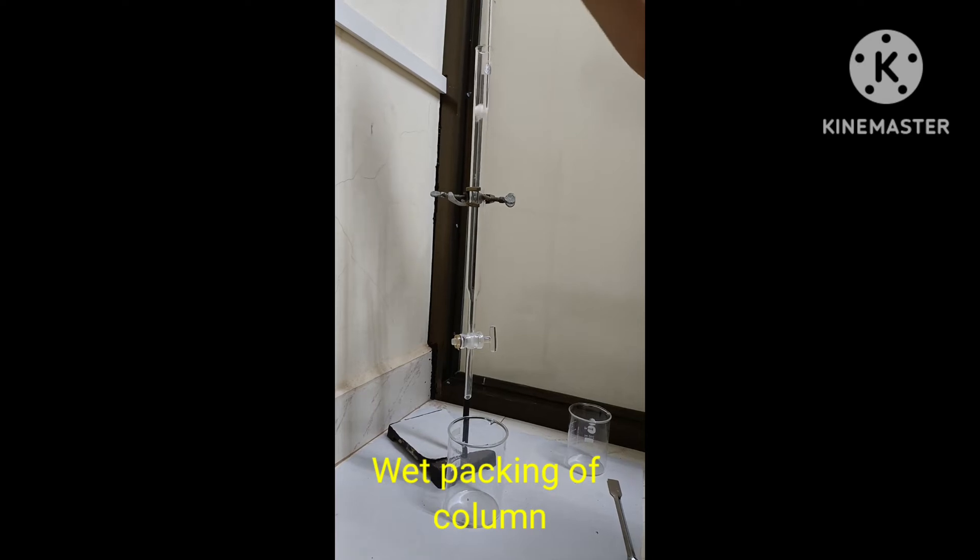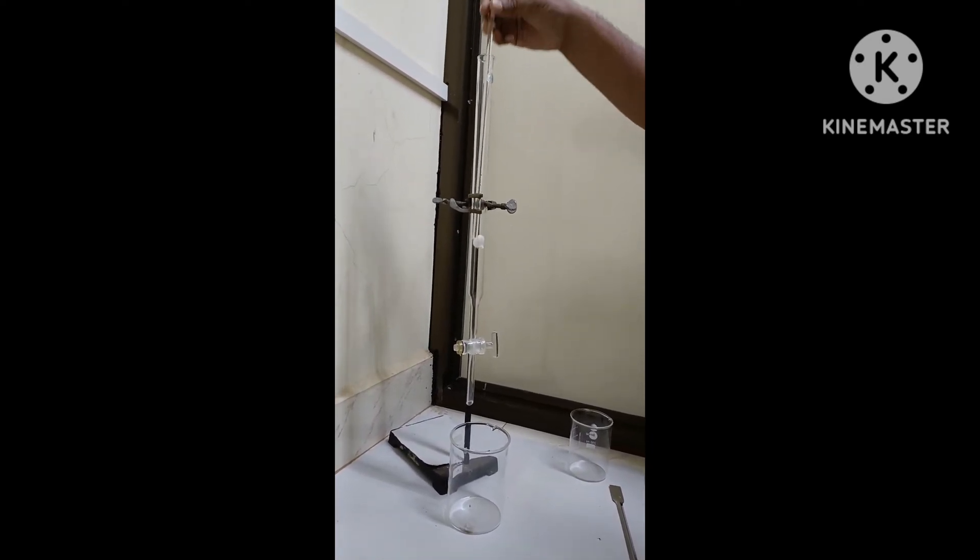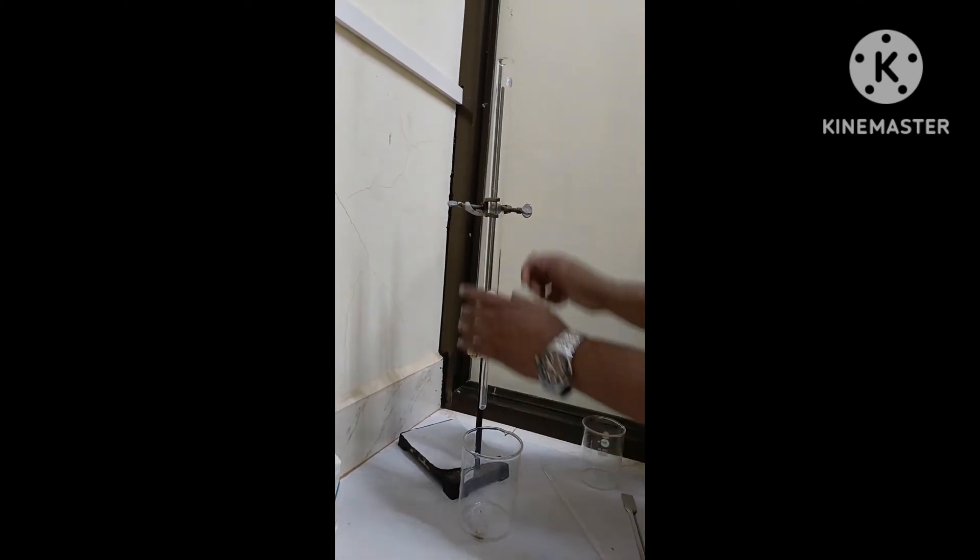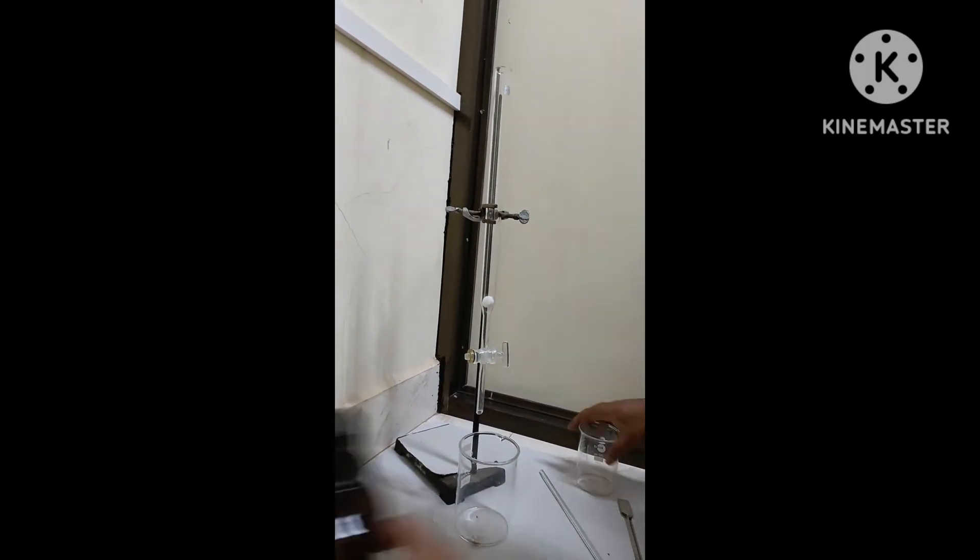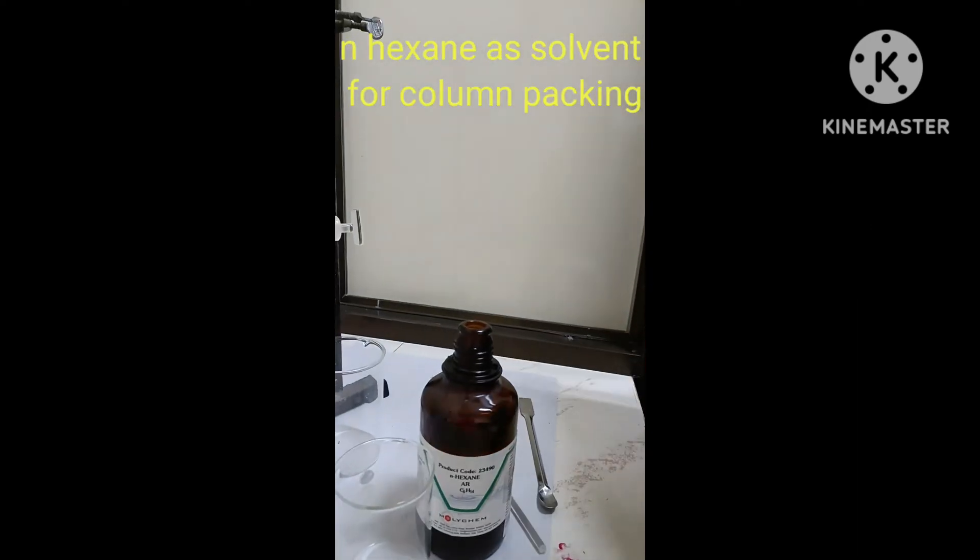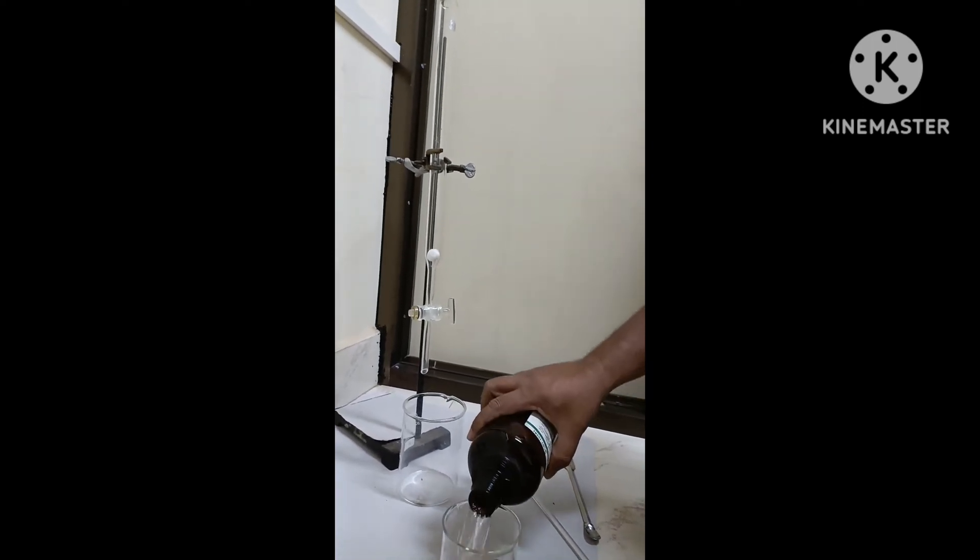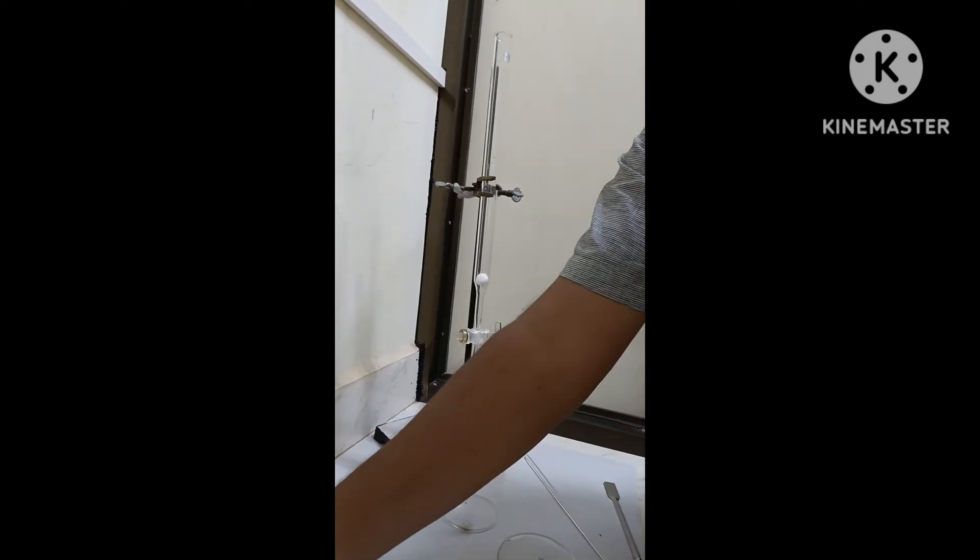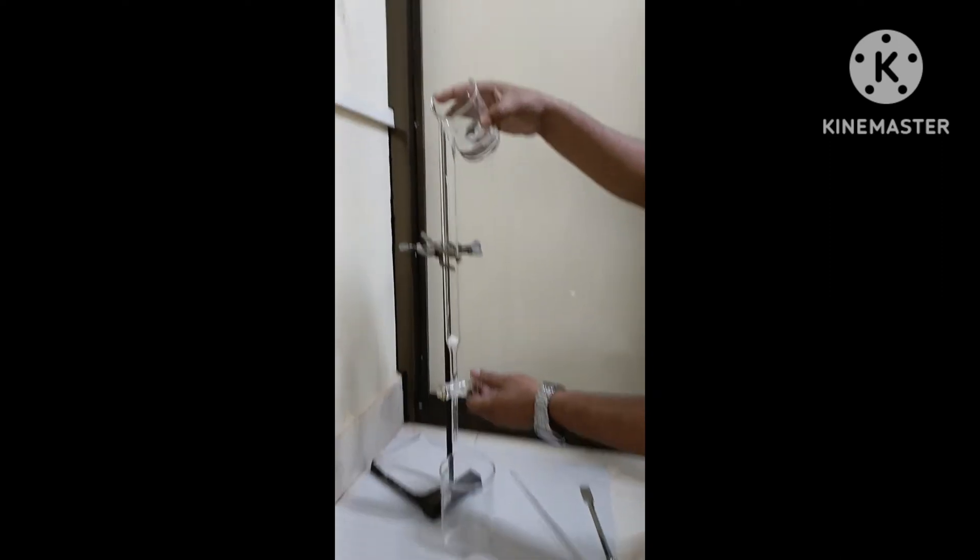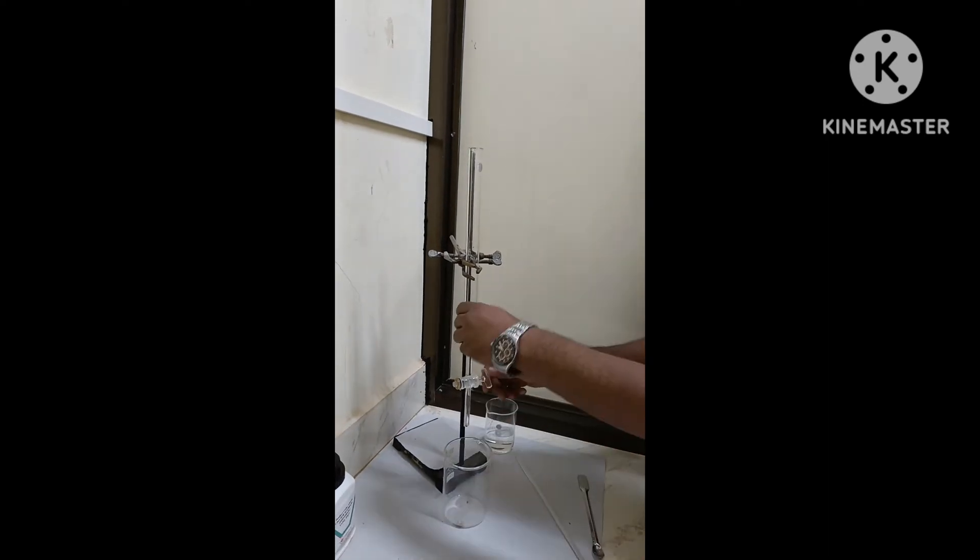Now we can pack the column using silica gel. We are inserting the cotton plug so that it can hold the stationary phase in the column. This column packing is by wet column packing method and we are going to do gradient elution where we will pack the column in n-hexane and then gradually increase the polarity using acetone.